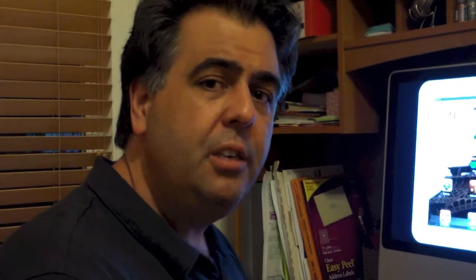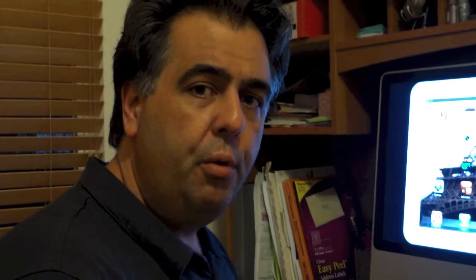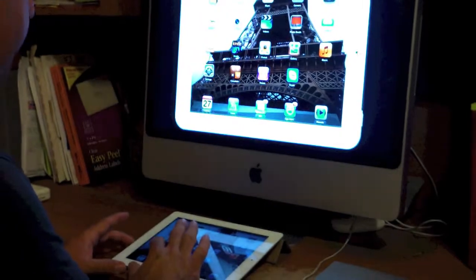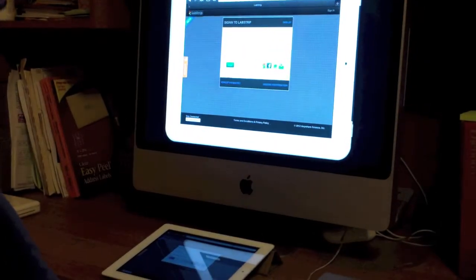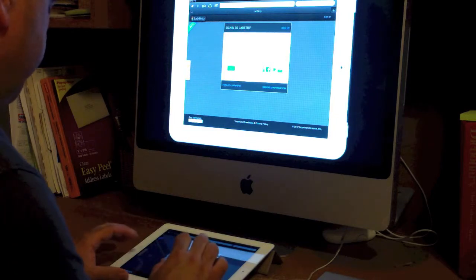Hi, Brian here. I'd like to do a demonstration of how LabStrip and Anywhere Science Cloud work together through our website and our mobile application. So I'm going to go over here and do this with my iPad. But what I'm going to do is go ahead and record this using a mirroring application so that you can see what I'm doing a lot more clearly.